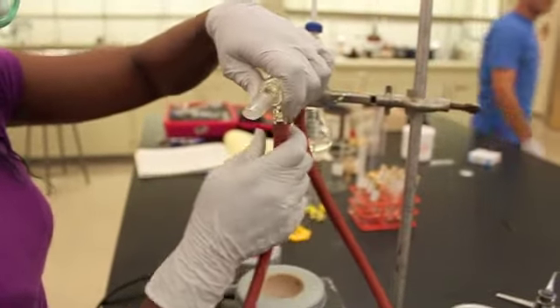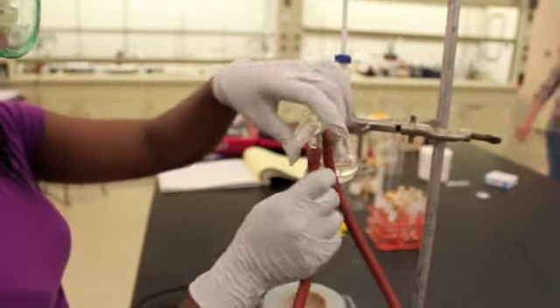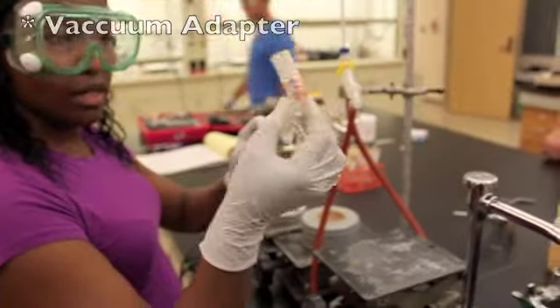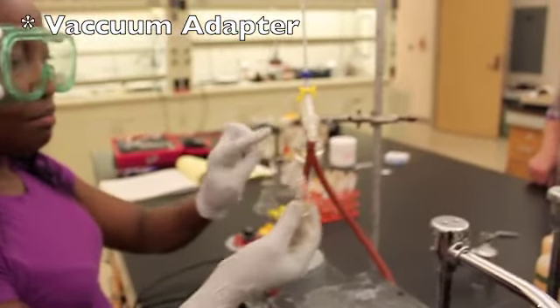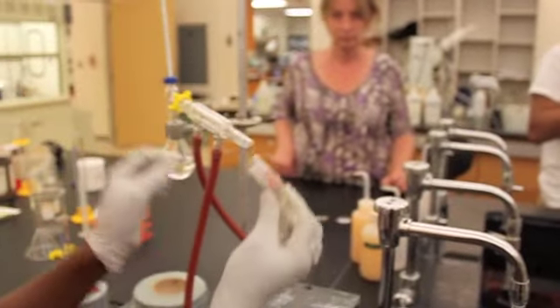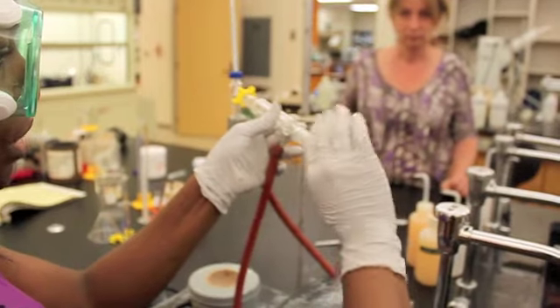condenser. And this is the water in portion, which is on the bottom end of your condenser. Then you wanna make sure your apparatus is always secure. You tighten it a little bit. You take your last piece, ensure that the joint is oiled, and you're going to put very little amount of oil, and you'll insert and you'll twist it again to ensure that you seal the joint.